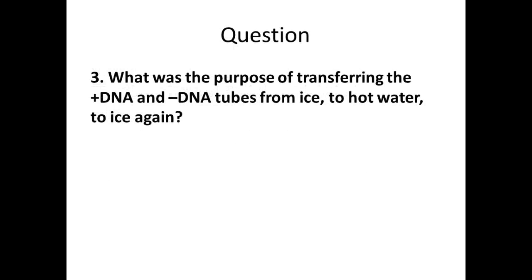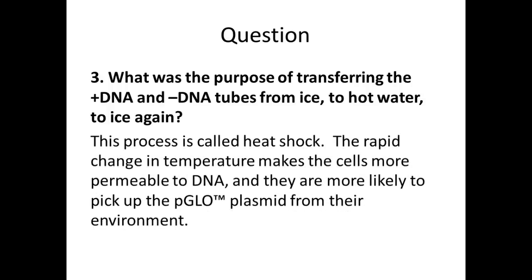Why are we doing this? What's the purpose of transferring both of these tubes from ice to hot water to ice again? It's called heat shock, right? And so you've probably even done this on vacation, right? When you go from the swimming pool to the hot tub back to the swimming pool, it's quite shocking to the system. Some people think it's fun, right? But in this case, we're doing it on purpose. This is heat shock, right? Where they're going cold, hot, cold. This makes them more permeable under these situations and more apt to take up the DNA.